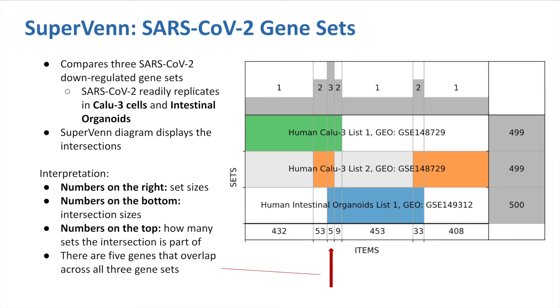This is a super Venn diagram used to compare three SARS-CoV-2 downregulated gene sets. Each of these gene sets is a human cell line that has been infected with SARS-CoV-2. SARS-CoV-2 replicates a lot in Calu-3 cells and human intestinal organoid cells, which is why studies have looked into these cell lines to understand how the virus works. Calu-3 cells are a human lung cancer cell line involved with mucus production, and patients infected with SARS-CoV-2 tend to have respiratory issues as well as gastrointestinal symptoms, which is why we look into human intestinal organoid cells as well.